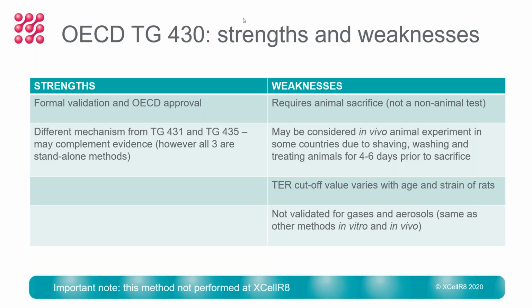The weaknesses are that the method does require animal sacrifice, and in fact in some territories the IATA states that it may be considered an in vivo animal experiment because of the preparation that is required prior to that animal sacrifice. So the stages of shaving, washing and treating the animals may be considered a live animal experiment. So that's just important to keep in mind.